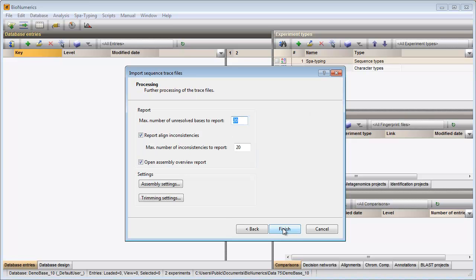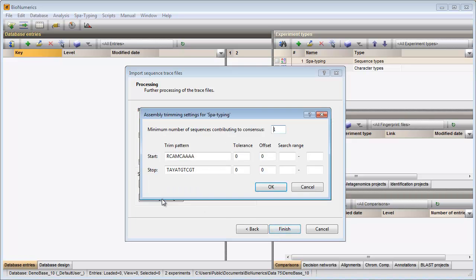In this last step I can specify some additional settings for the preprocessing of my trace files. Pressing the trim settings button allows me to define the start and stop patterns for the spa typing experiment. The patterns are automatically filled in, so there is no need to change this information here.